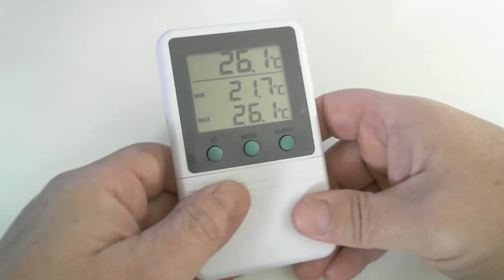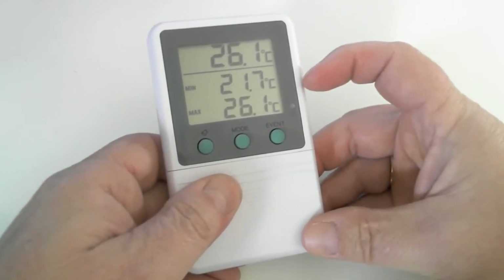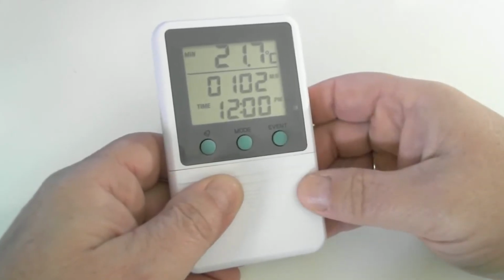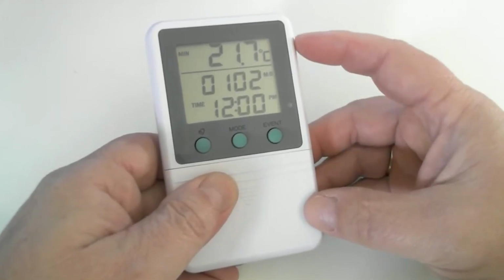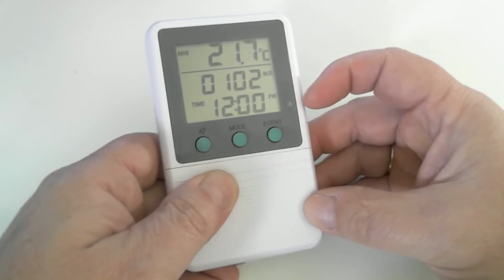The LCD screen is currently showing the main display, which is showing the current temperature at the top, the minimum recorded temperature in the center, and the maximum recorded temperature at the bottom of the screen. If we hit the event button, we will get when these events have happened. At the top, we have the minimum temperature recorded with the month and day in the center of the screen and the time at the bottom of the screen of when the occurrence happened.